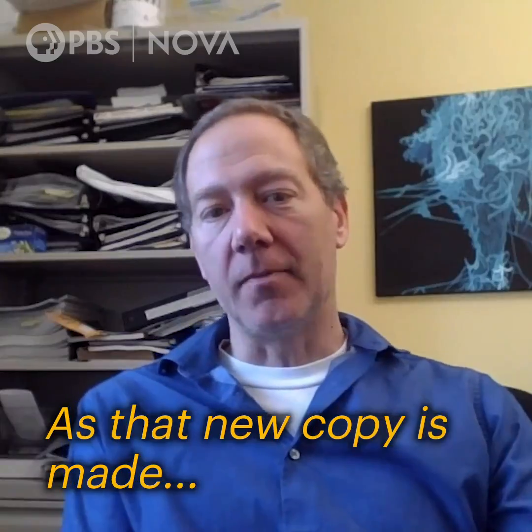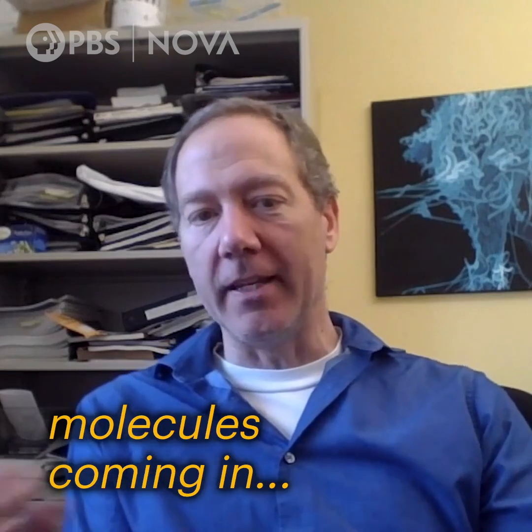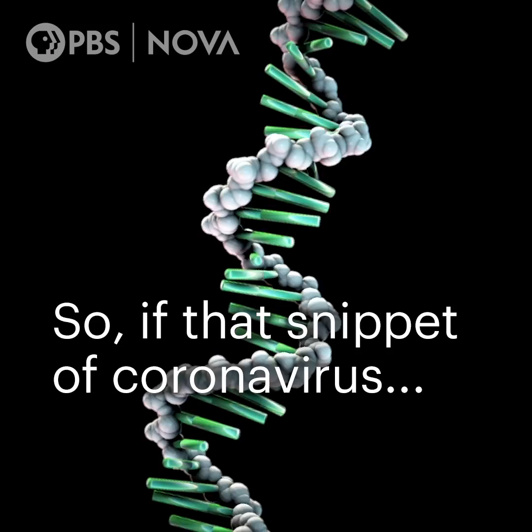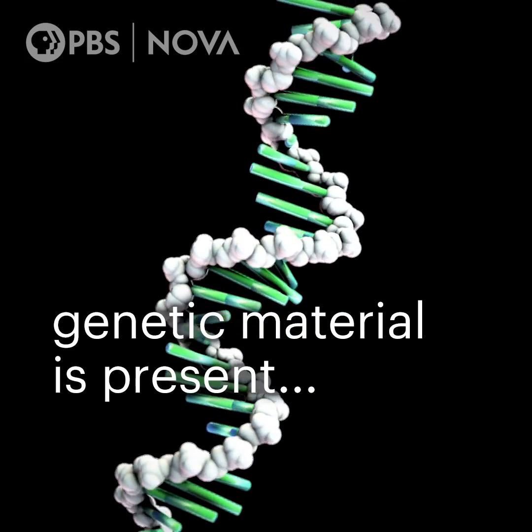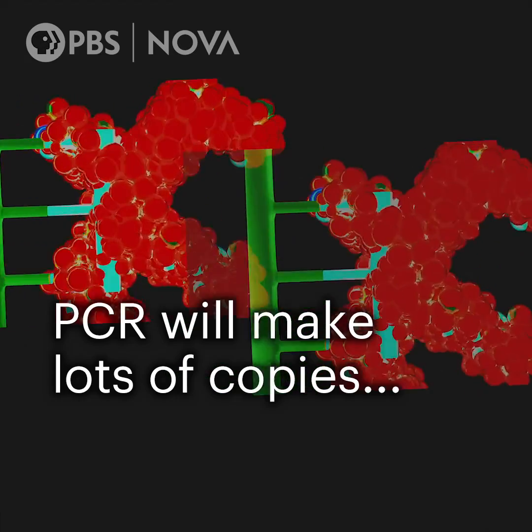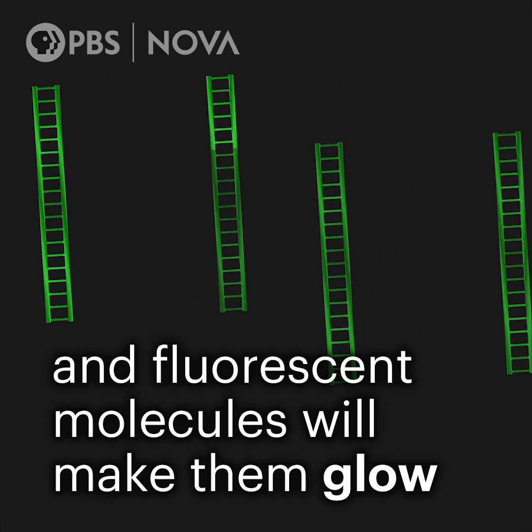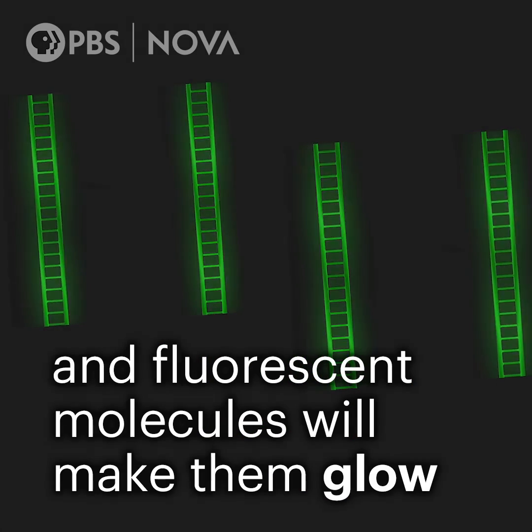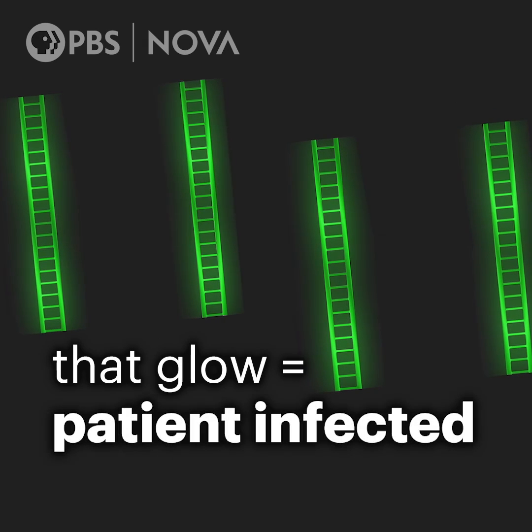As that new copy is made, now you get fluorescent molecules coming in and binding to that new copy. So, if that snippet of coronavirus genetic material is present, PCR will make lots of copies. And fluorescent molecules will make them glow. That glow means patient is infected.